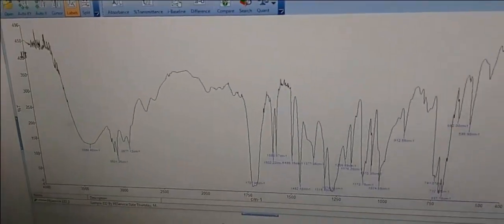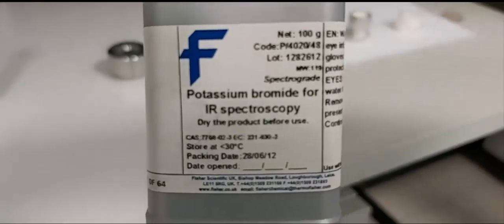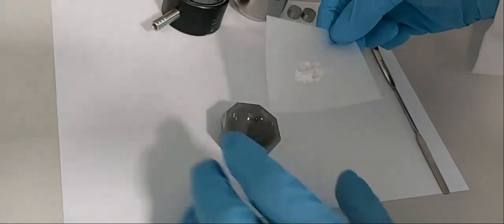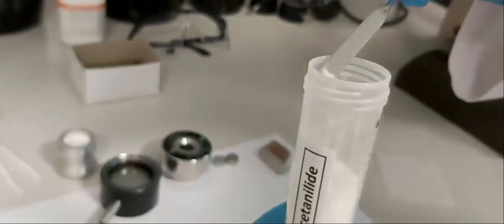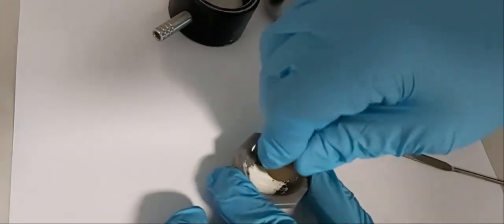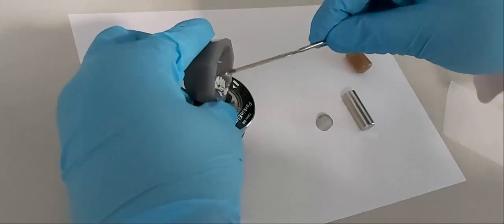For the next sample, acetanilide, we will use KBr. We weigh 200 milligrams of KBr and place it in the small mortar. We take a small amount of solid acetanilide with a spatula and mix it together with the KBr. Then we grind the mixture until we obtain a very fine white powder.